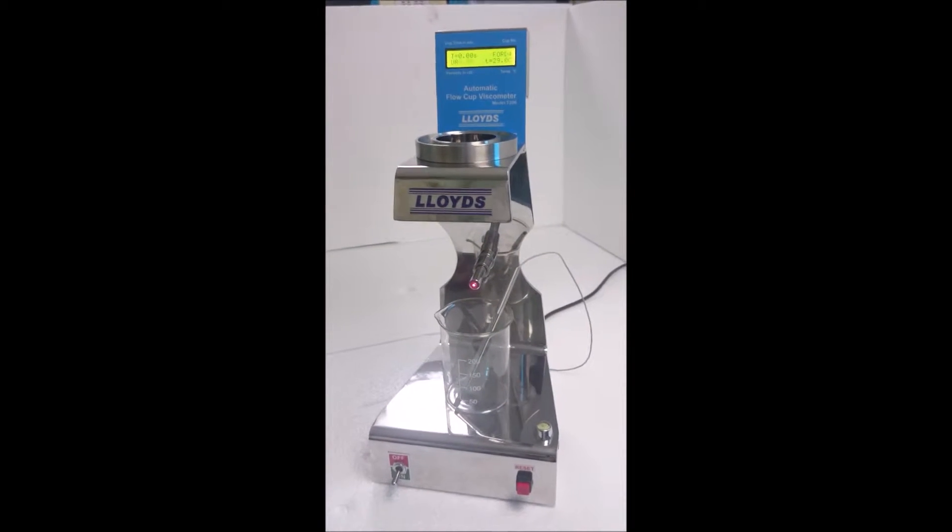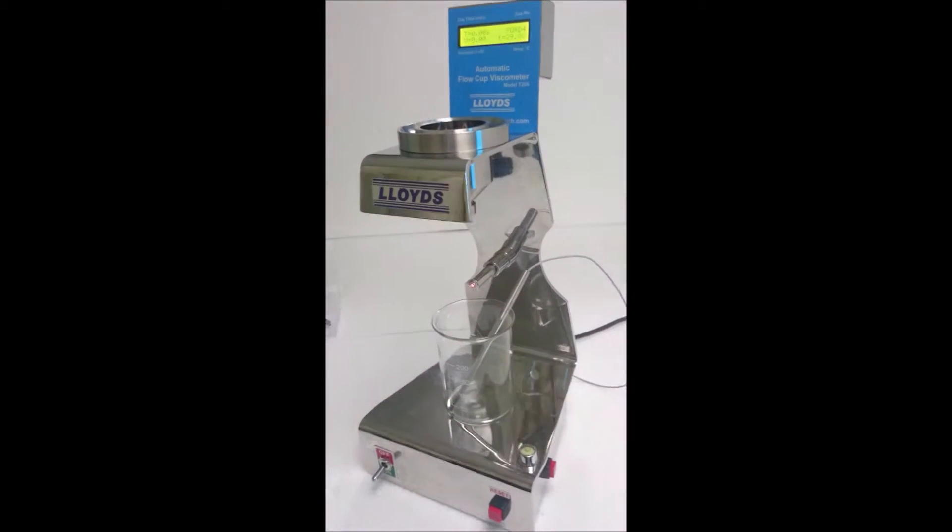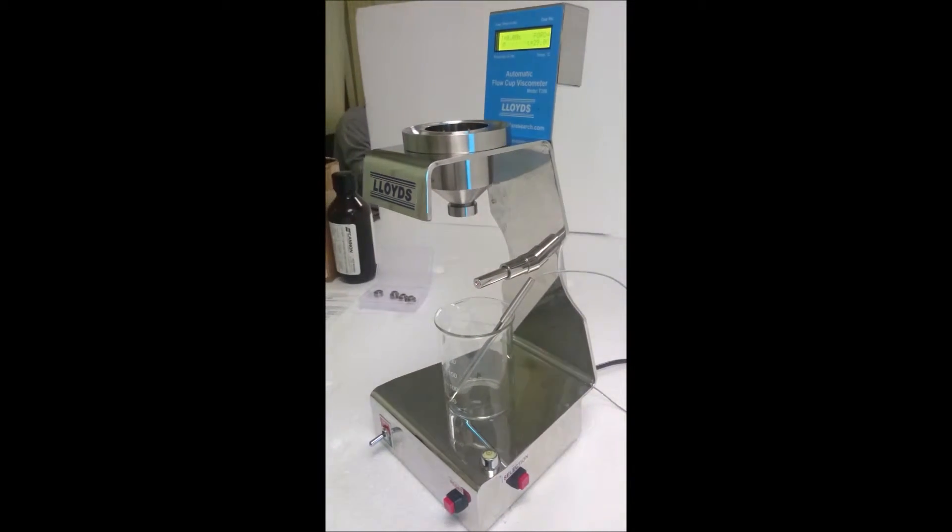It automatically determines the start and first break in the flow of liquid, thus eliminating human errors in flow time measurement.